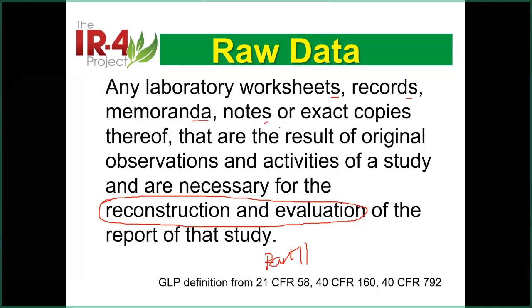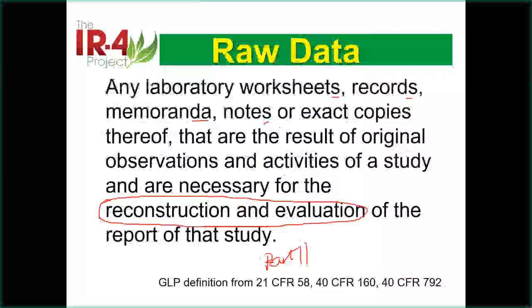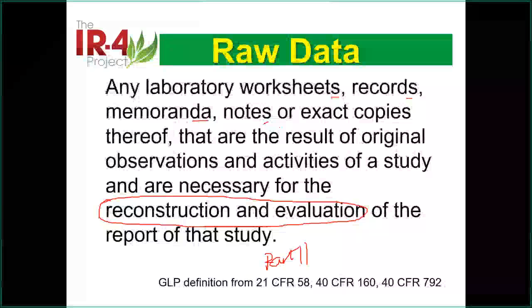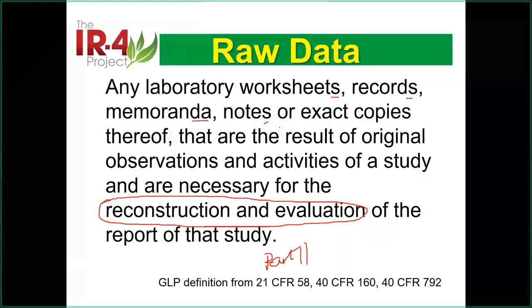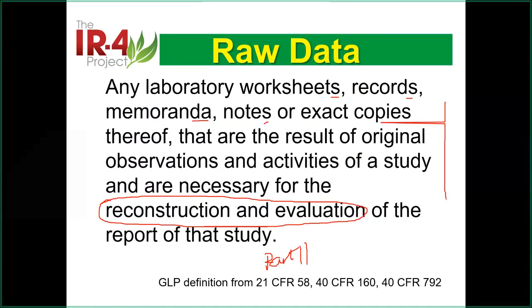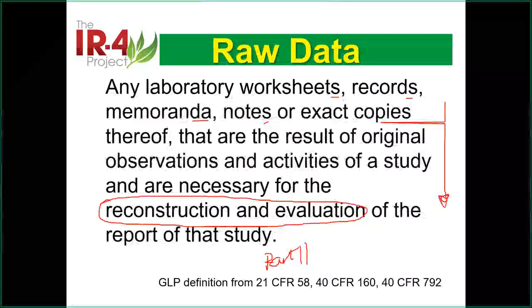You can type everything in, or, for example, if you weigh your sample and put it on there, it will generate electronic data to your database. The LIMS, laboratory information system, will record the data automatically. So all those things, you should do the same way. If you provide the data in the same way, they will accept.